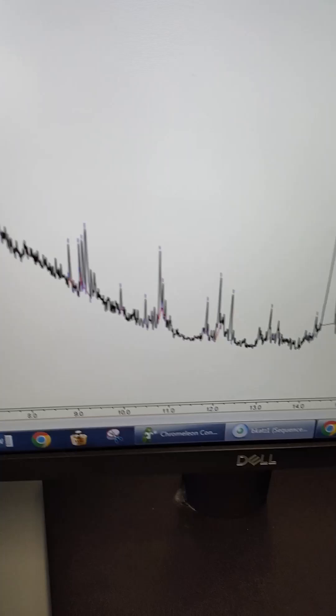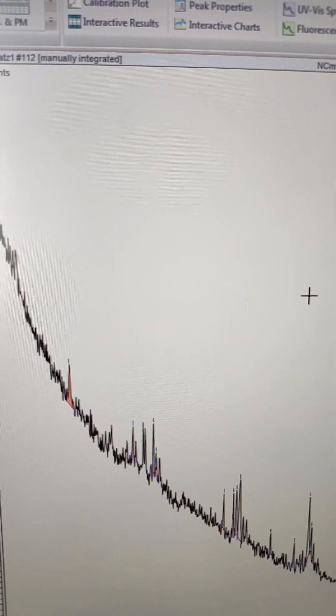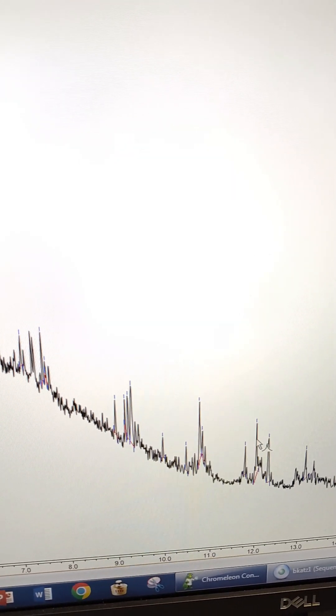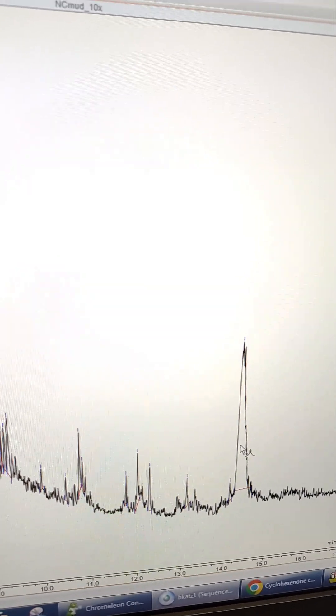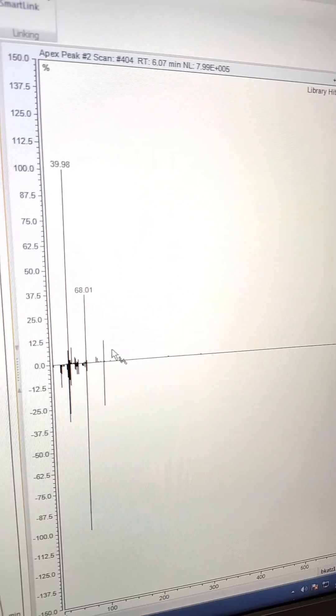Alright, I got the GCMS data here. This is that North Carolina mud extracted. There's a lot of very minor peaks. The sample is probably quite dilute just because there's so many things in mud. I checked all these masses. These are kind of just boring hydrocarbons that would be from environmental samples in soil. This is triglyceride fat. Very common. Not too worried about that.